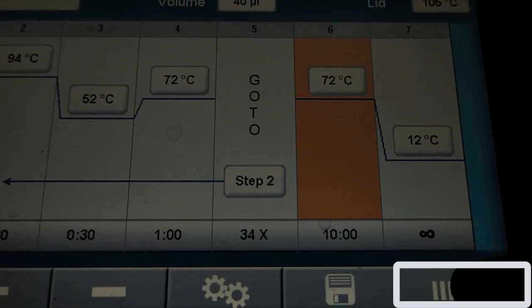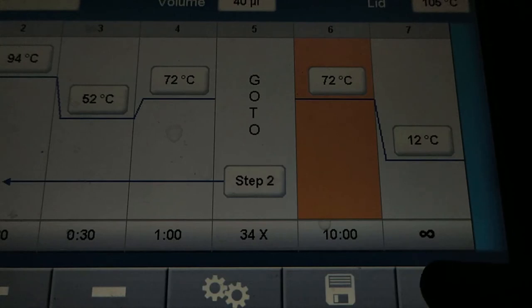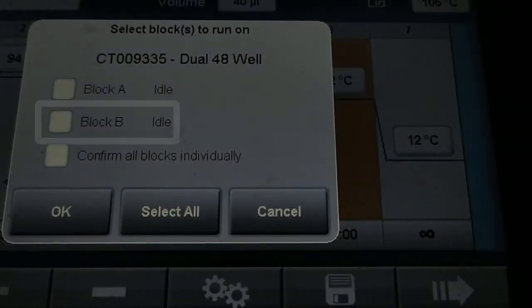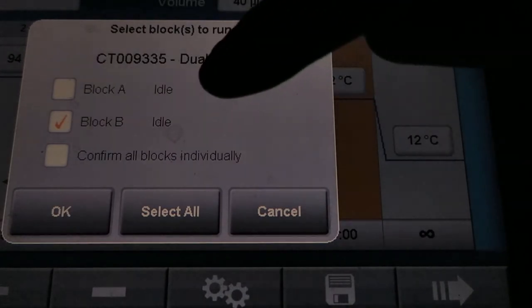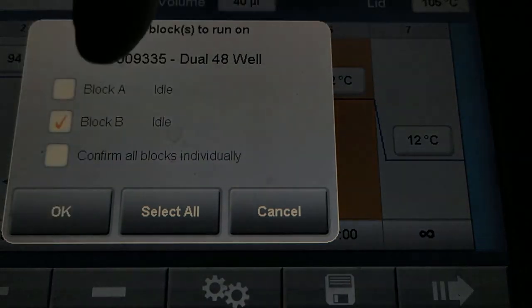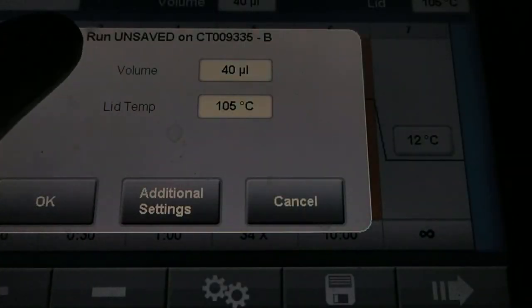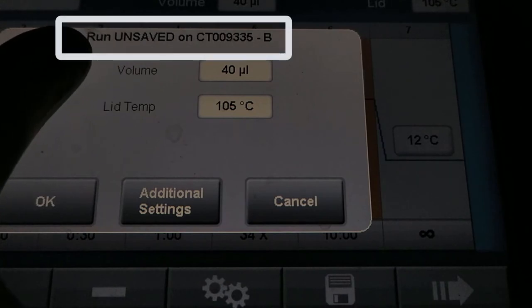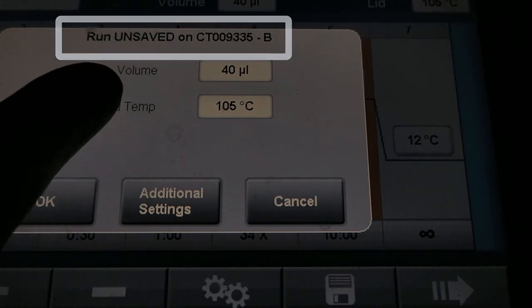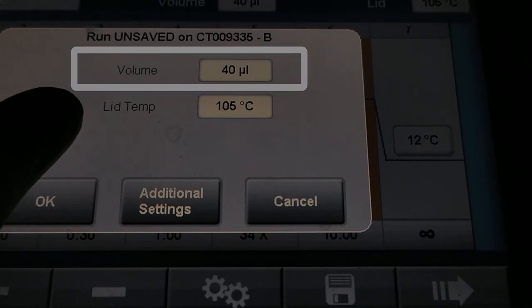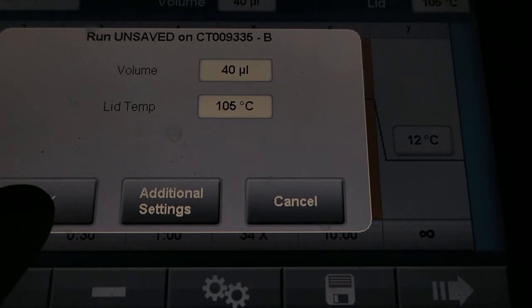Now we are going to start. Now we can press on the run button here. So this arrow here shows the running of the protocol. So just press on it. And on this screen choose the block and we are going to use the block B. After that we have the option to select all. We do not do that. We press on OK. And now you can see that it again asks the running the start of unsaved protocol with the volume of 40 microliters and lid temperature of 105 Celsius degrees. So press OK.